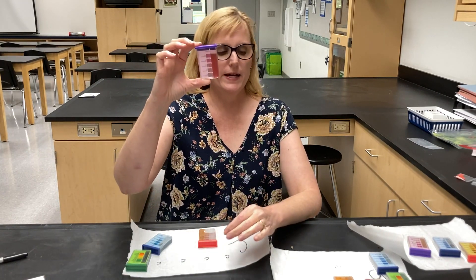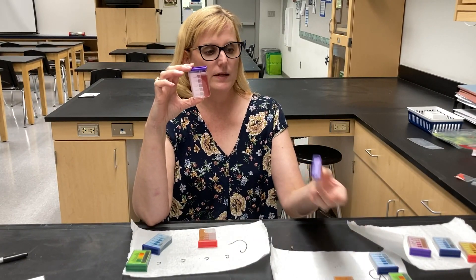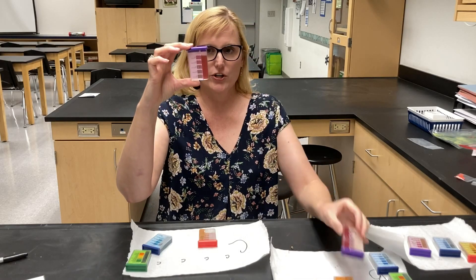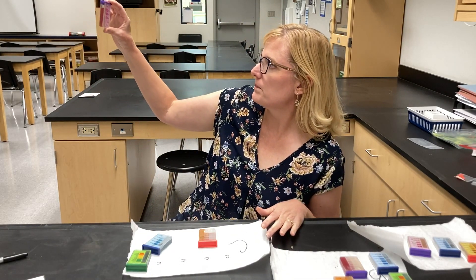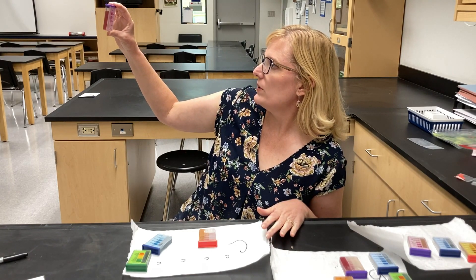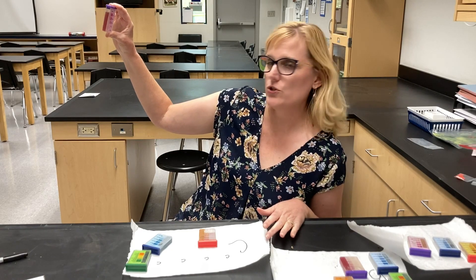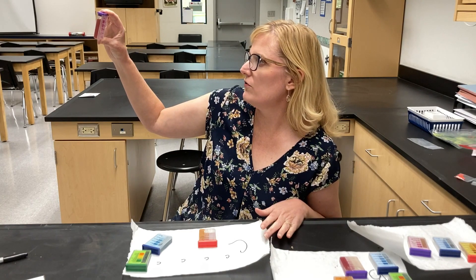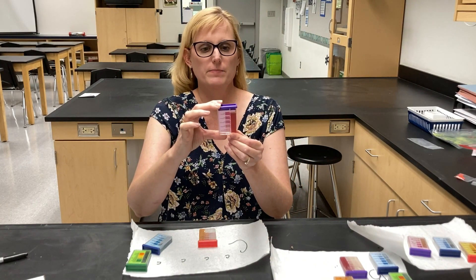The nitrogen shows a good amount — not quite as dark as sample B. Comparing the two, sample C is slightly less dark than B. I would say nitrogen for sample C is sufficient, maybe between adequate and sufficient when I look at it in the light, but more on the sufficient side.